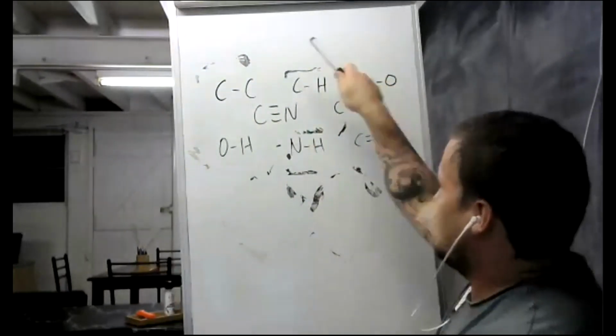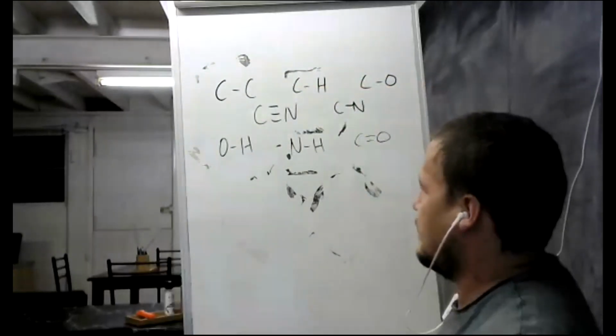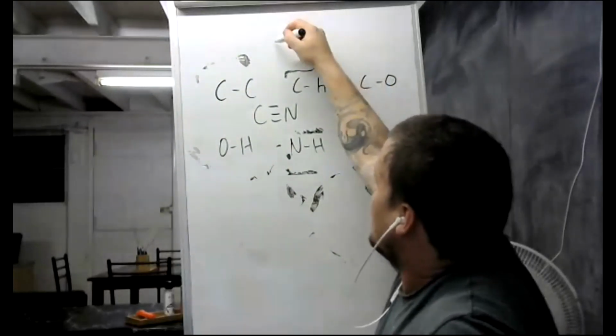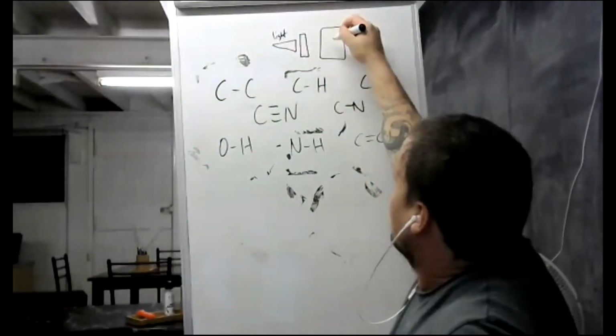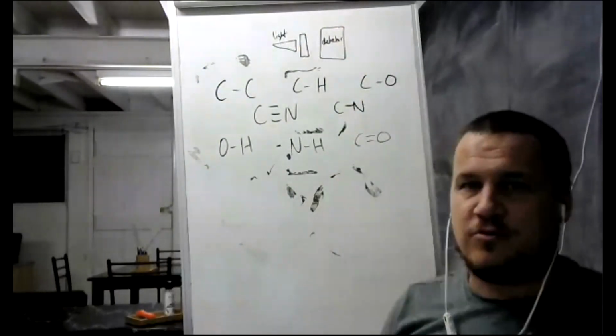These various bonds are sitting in a solution here in our aliquot. Here's our source of light. And here's our detector. My very low tech drawing.